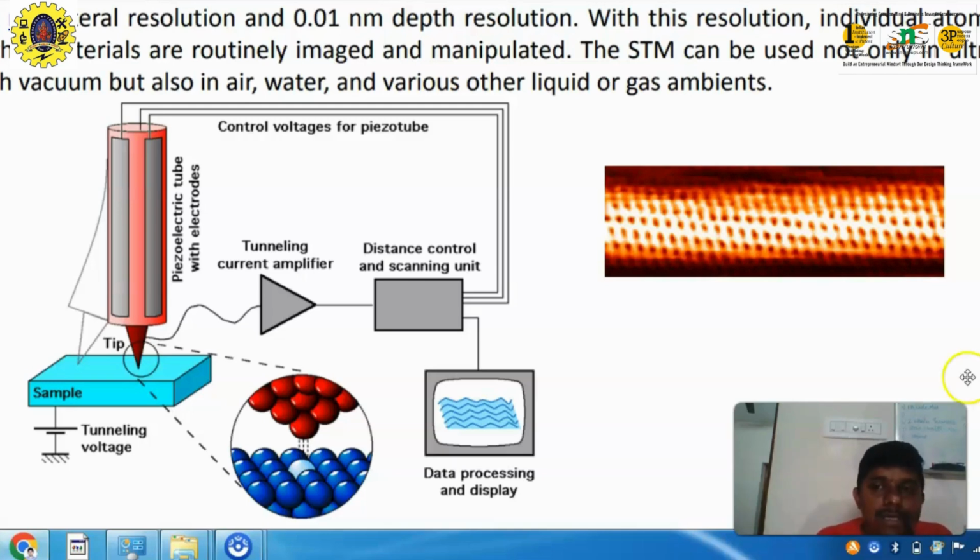Here you just see there is a fiber, inside we have twisted fibers, and there are short fibers, and the sizes of the fibers and the gaps between the tied levels can be up to the micro and also nanometer sizes.